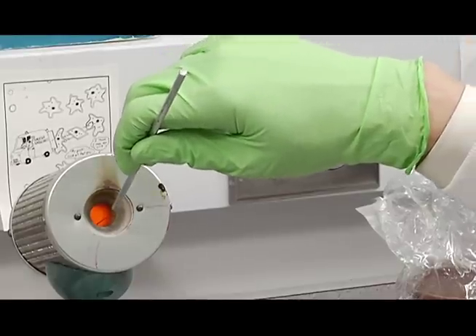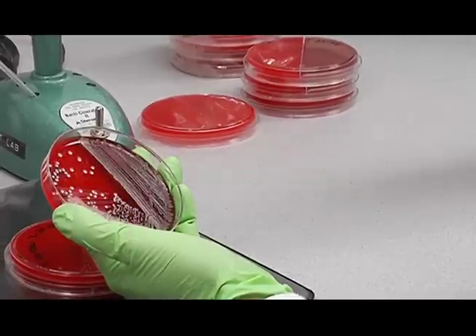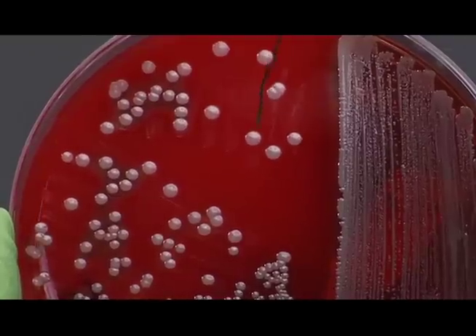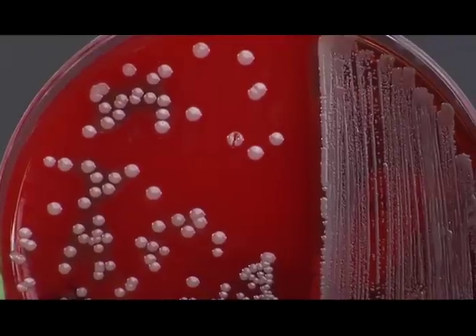Sterilize your loop in the bacti-incinerator. Then take your inoculum off the stock culture plate — we're going to just barely touch one of those isolated colonies with the tip of the loop. You can just see a divot there in the center of the colony.